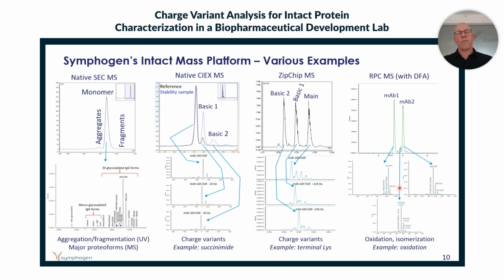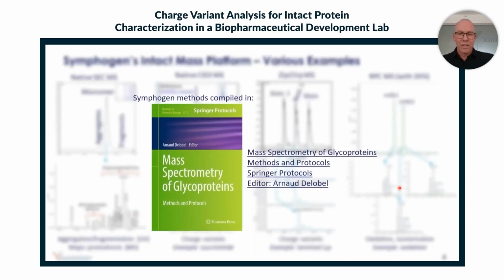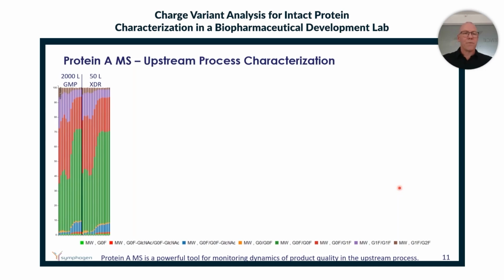So the combination of different separation techniques with an MS readout is a super powerful tool for really mapping what's going on at your molecule at the intact level or subunit, if you prefer that. Yeah, it's been compiled in this publication. I'll move quickly on.